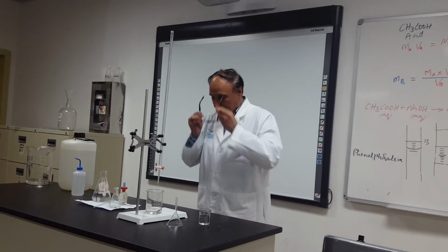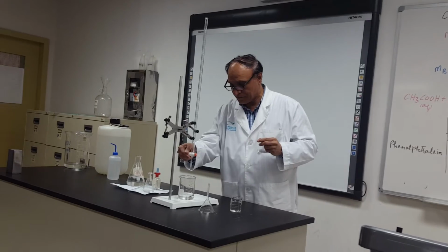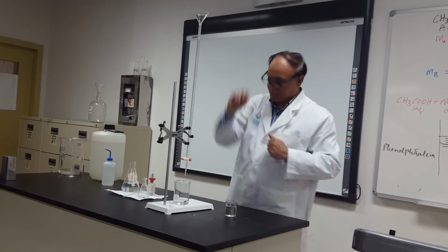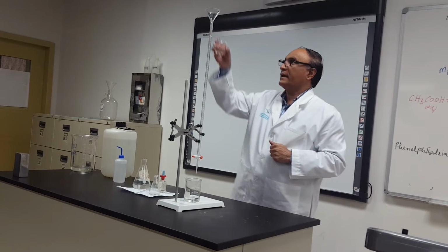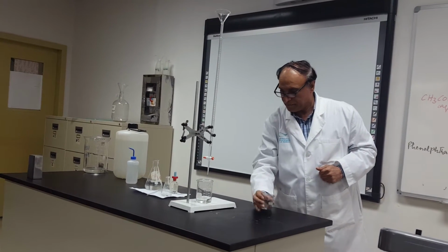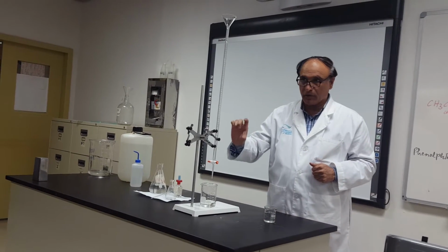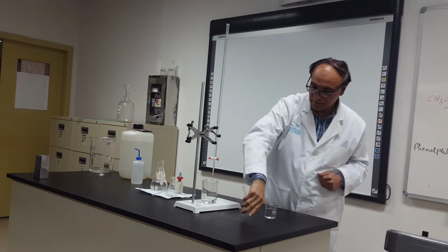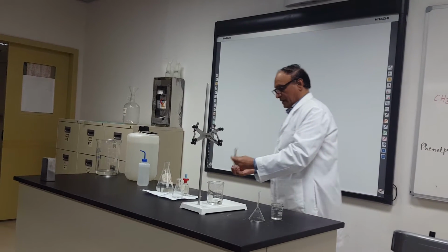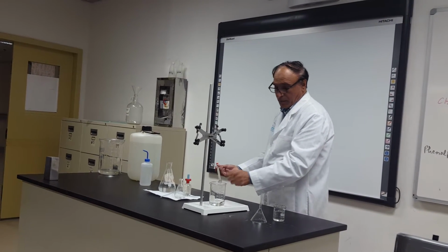Right? So I close this, put the funnel over here, and put some sodium hydroxide, not too much, some quantity. Remove the funnel, take it out, and don't put it back here.